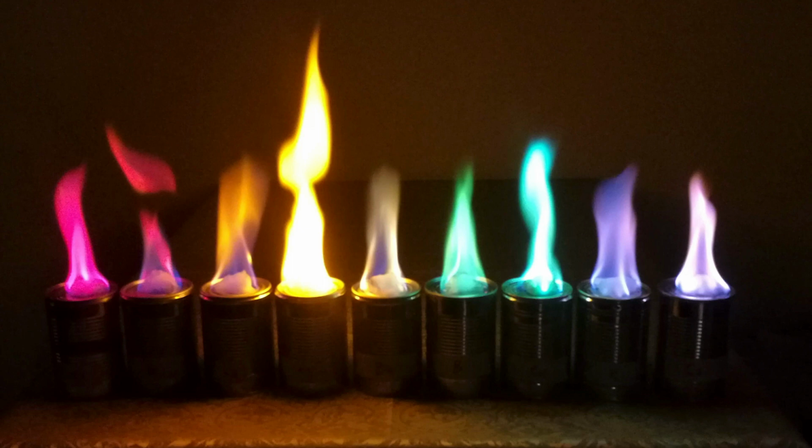Sodium is a common component or contaminant in many compounds, and its spectrum tends to dominate over others. The test flame is often viewed through cobalt blue glass to filter out the yellow of sodium and allow for easier viewing of other metal ions.